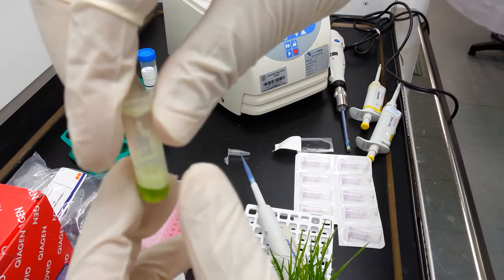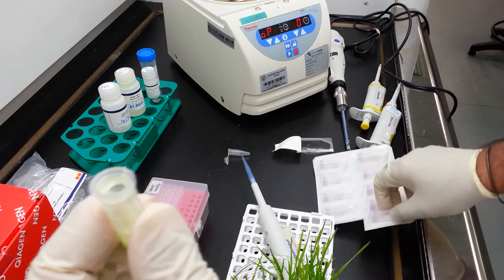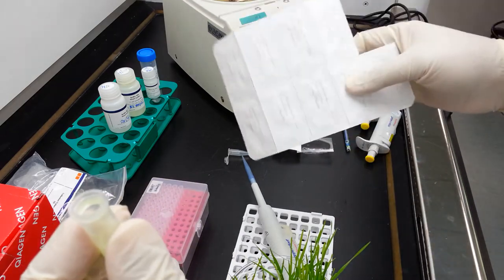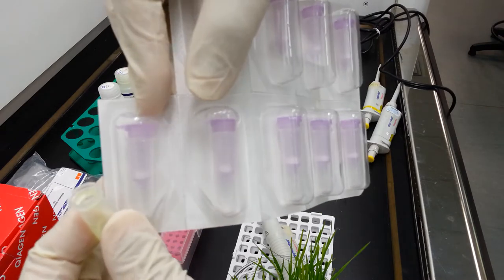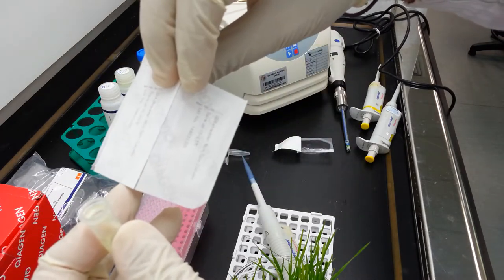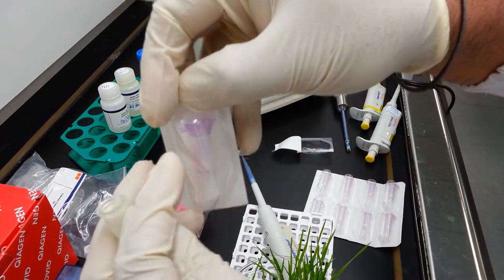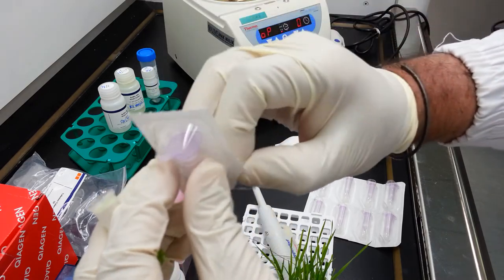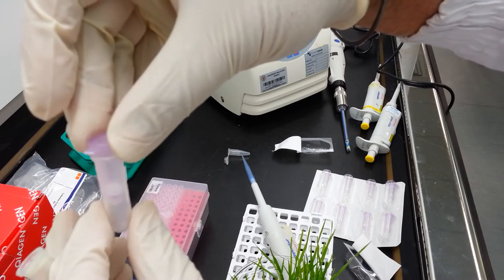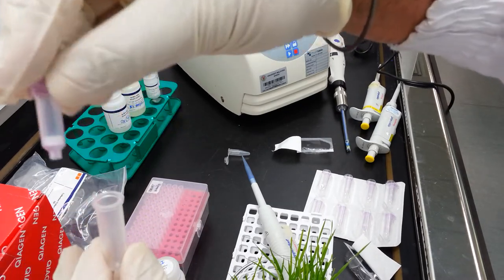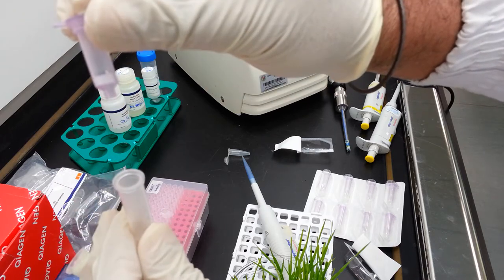This now represents the lysate which contains all the nucleic acids including the DNA and RNA. Now the RNAeasy plant kit comes with this column which is purple in color and this is termed as the Kaya shredder column. The column consists of two sections.